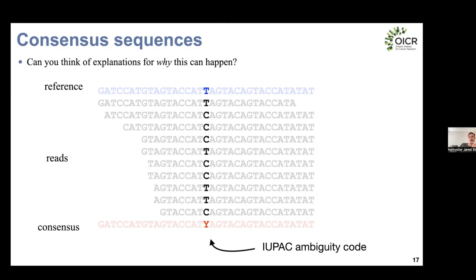Now, something I didn't talk about is that the genome here is tiny. It's 30,000 nucleotides. And modern sequencers generate huge amounts of data. So it would be huge overkill to sequence one coronavirus sample on one sequencing run. So typically what we did is multiplex by adding barcodes to each sample, and you multiplex 100 or even 400, even more samples on individual sequencing runs.